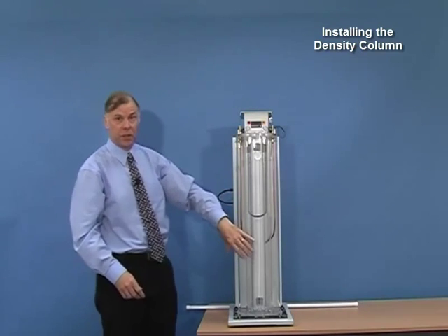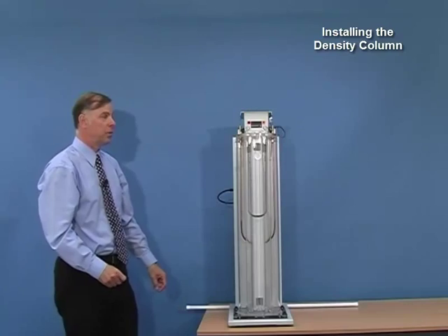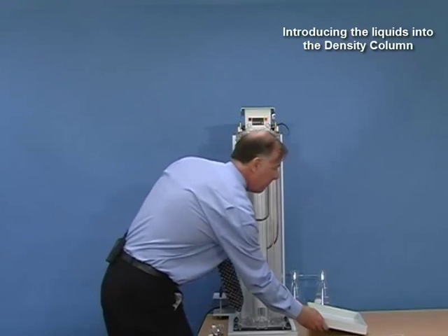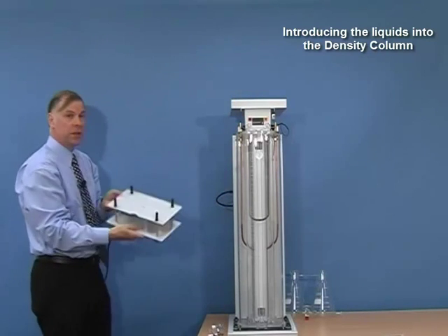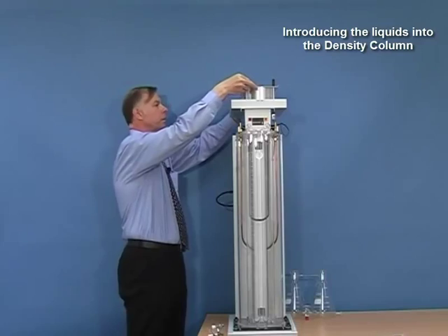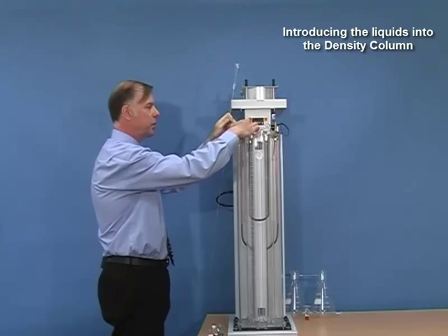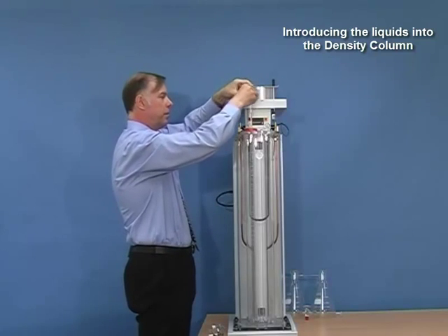Now we have the two tubes fitted into the assembly and we need to fill the tubes with the required liquids. These liquids can be various combinations depending upon the density range required. The next thing is to introduce the liquids into the density column. Replace the drip tray on top of the unit, then the stirrer assembly on top of the drip tray with the location studs upwards. We need to introduce the capillary tube into the tube, place a cap with a hole over the top, secure it with a clip, and lower the capillary right into the bottom of the column tube.